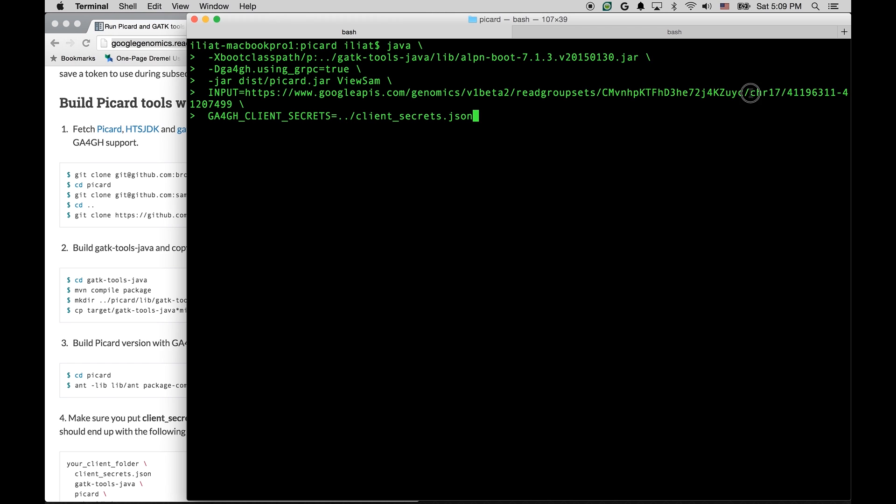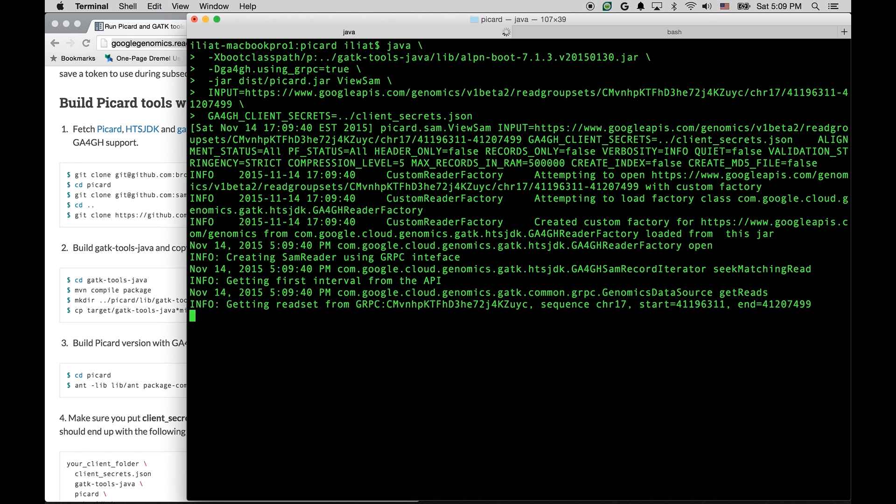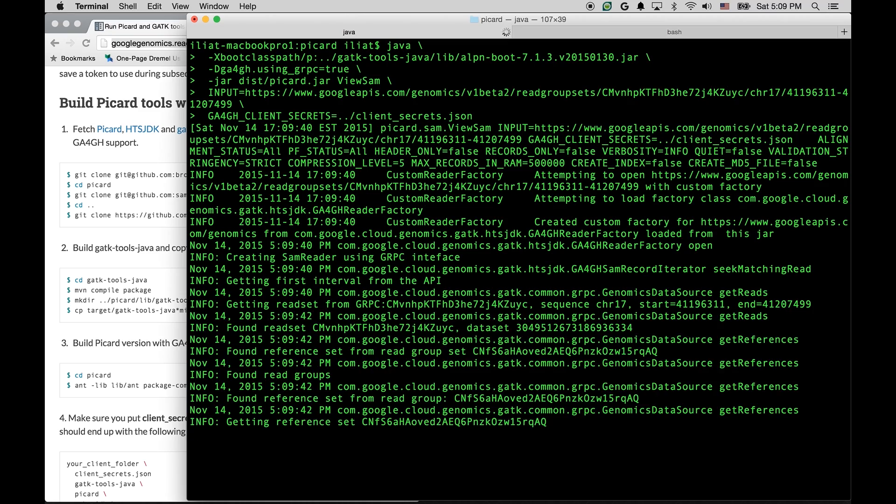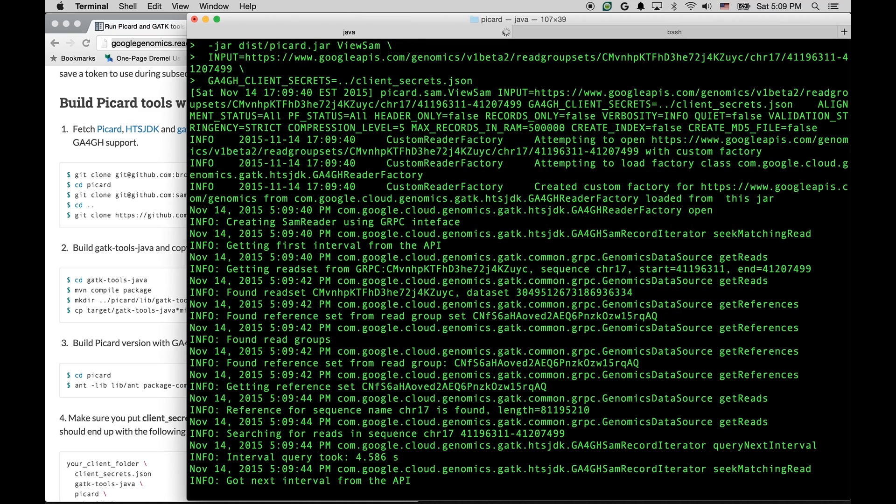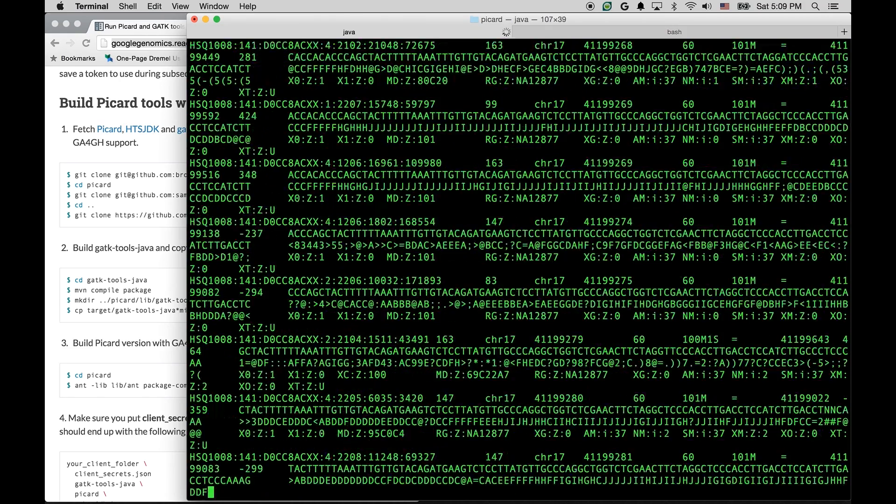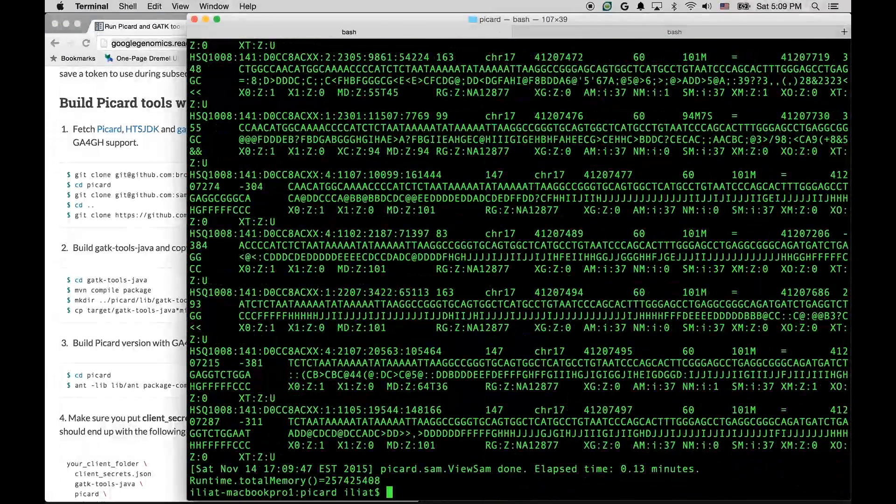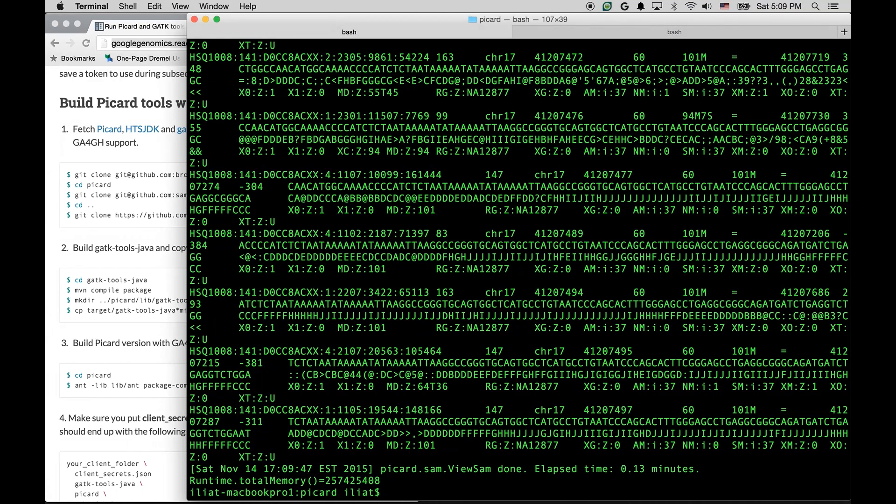But notice that in addition to specifying the read group set ID here, we have also specified the reference that we want to use, and a specific genomic range that we want to process. So this worked, and we only got the reads from this genomics interval.